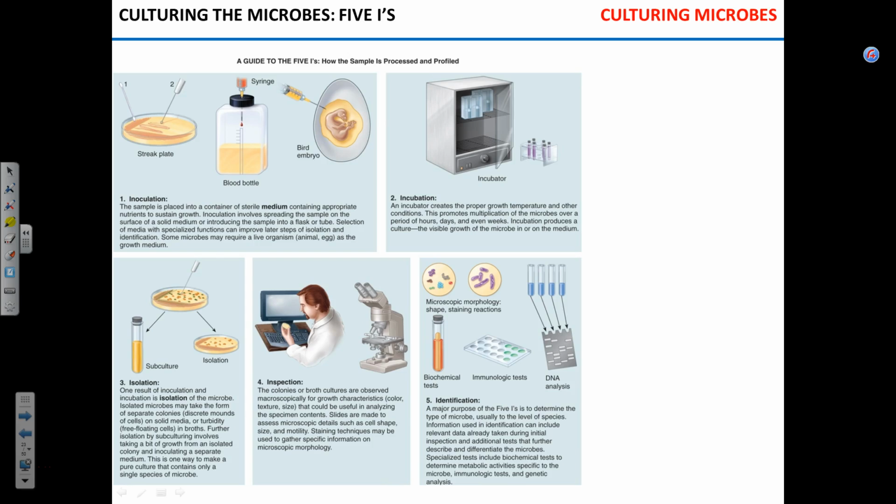What if you have several species in a sample? Can you now detect all of them, see all of them? Yeah. Like we saw different types of colonies in our hand wash plates, right? And when you grow a lot of them, you can put them under the microscope. You can subject those samples to other methods of studying, essentially identifying what is going on in the clinical sample that you are working with.